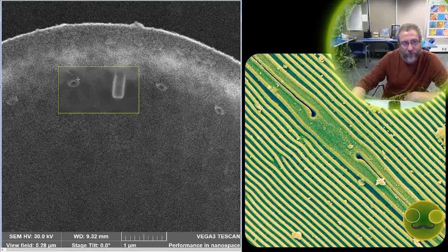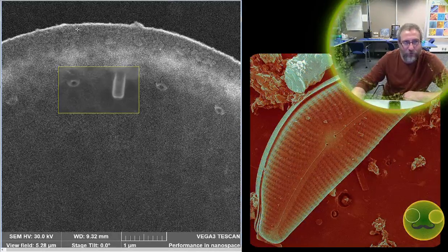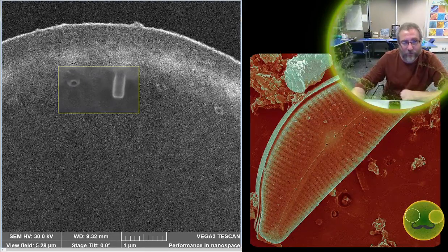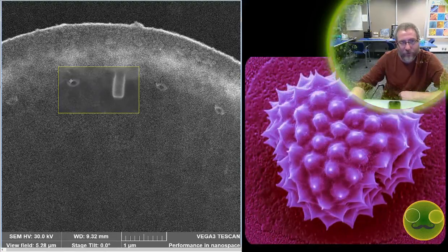And then they have these little tiny coverings that go over the process. These ones are just little tiny thorn-like things that are built out of the central tube. And then this tube goes all the way through to the outside. That's how we identify something as a process. It starts on the inside of the cell wall and it goes all the way through to the outside. And so when we get an outside view of this diatom, you'll be able to see what it looks like on the outside, but on the inside it's basically just a hole with a little donut with little holes around it that are linked with it, and it covers over the satellite pores.